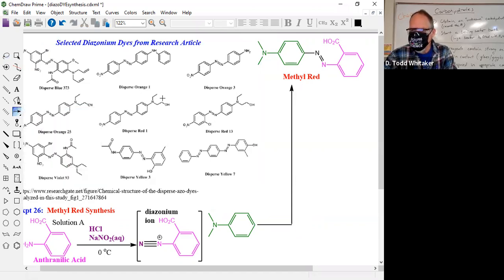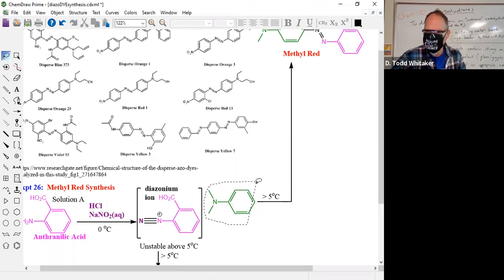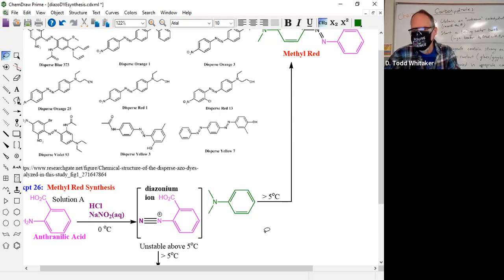Now you do want the thing to react. You do want it. There's where you want it to warm up, right? One of the steps you have it, you're adding this chemical, which you've all done, I think, or maybe not. Have we added this chemical yet? Yeah. And the reaction really doesn't start happening until you lift it out of the cold water, which is what, step 8? Then this reaction's happening, okay?